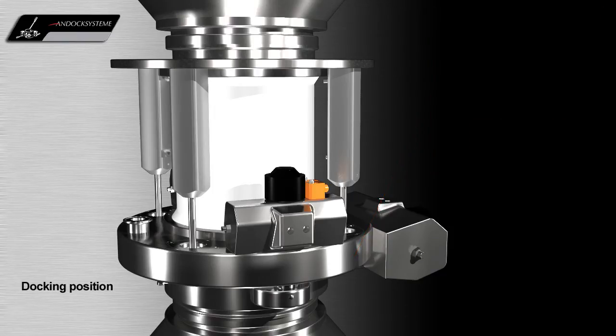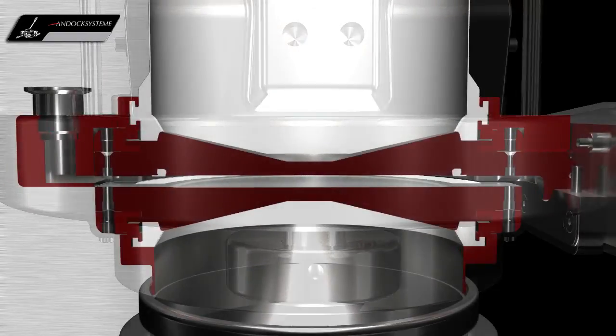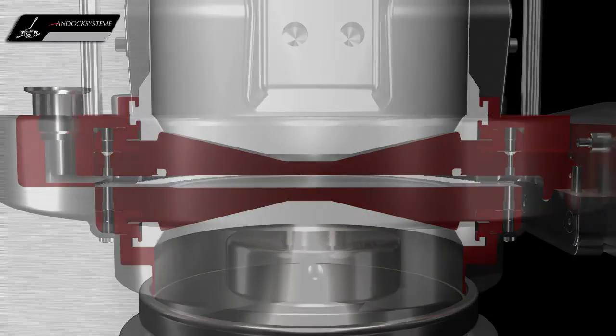In the docked position, before the valves are locked together, the valve faces can be swept with a vacuum to remove any loose contamination. Ambient air is drawn from the room between the active and passive valves through the suction nozzle.